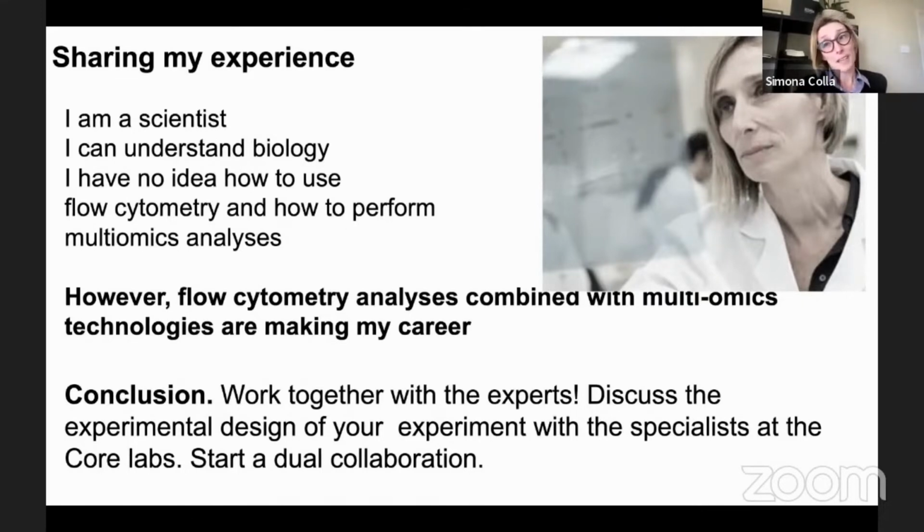However, in the last, I would say, 3 years, it's clear that these technologies together, flow cytometry plus multi-omic analysis, made my career. If I have to thank someone, I need to thank the experts at the core facility. So the first message I would like to deliver is this: you cannot do everything by yourself. Contact the experts at the flow cytometry and sequencing core labs and start a dual collaboration.